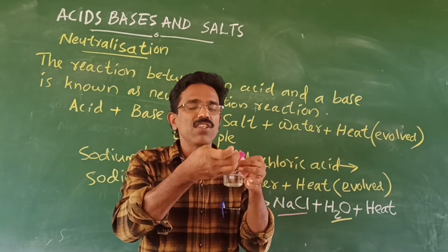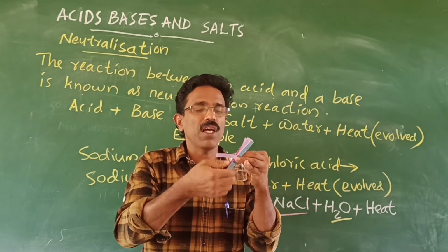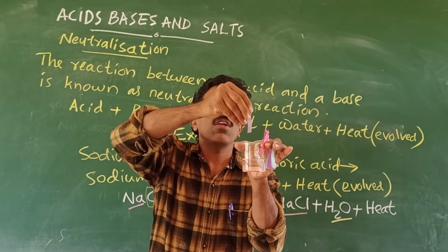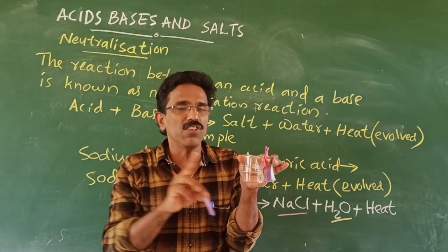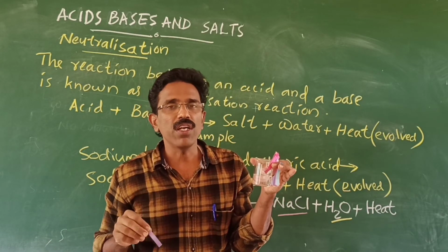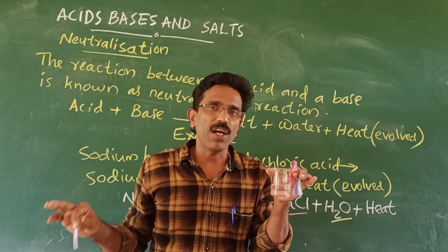Now I am testing this solution with blue litmus paper. Let us take a blue litmus paper and test the solution. See, blue litmus paper remains blue. It means that this solution is neither acidic nor basic. Why? The effect of hydrochloric acid is neutralized by sodium hydroxide.